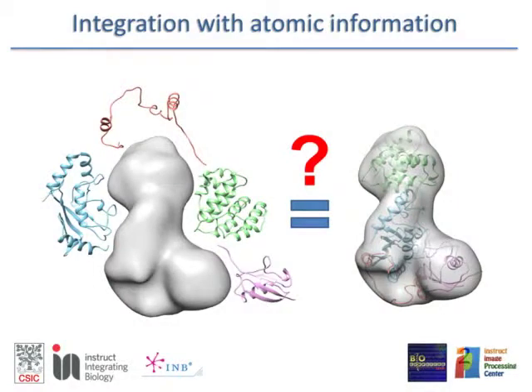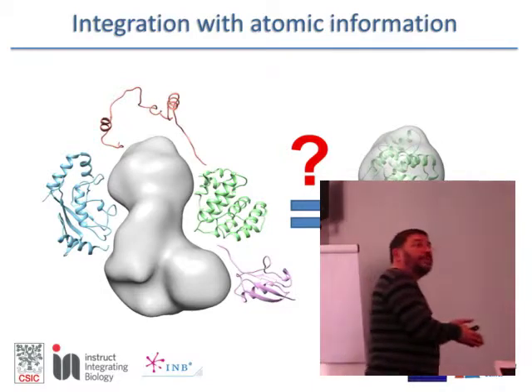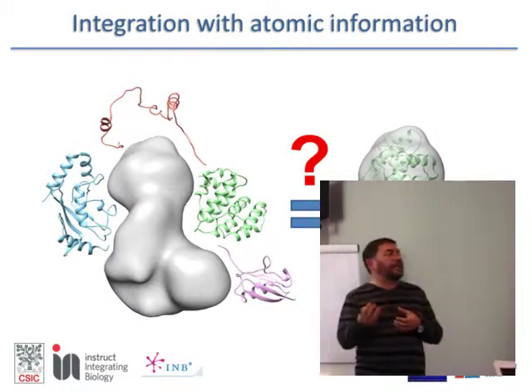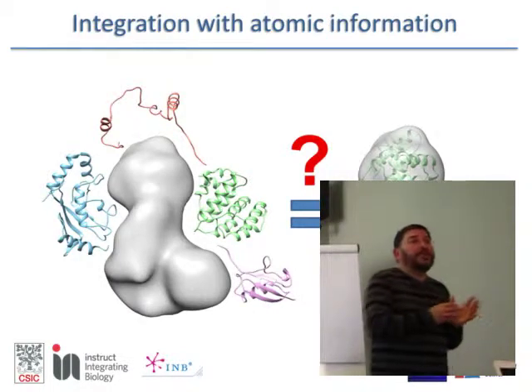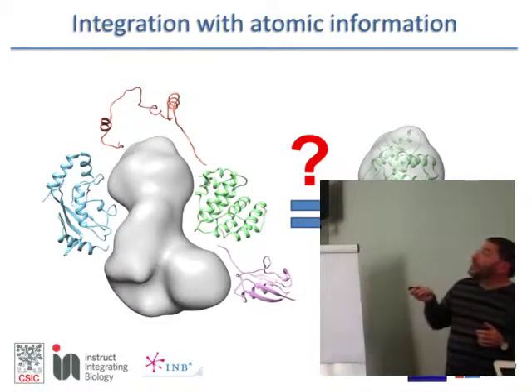How are we going to incorporate information in electron microscopy? You are coming, some of you, from X-ray diffraction, fantastic. We may be looking at a larger complex by electron microscopy, and we can put into that complex X-ray diffraction information at atomic resolution of a piece, or NMR information of a piece at atomic resolution, and this is the type of integration that you do.